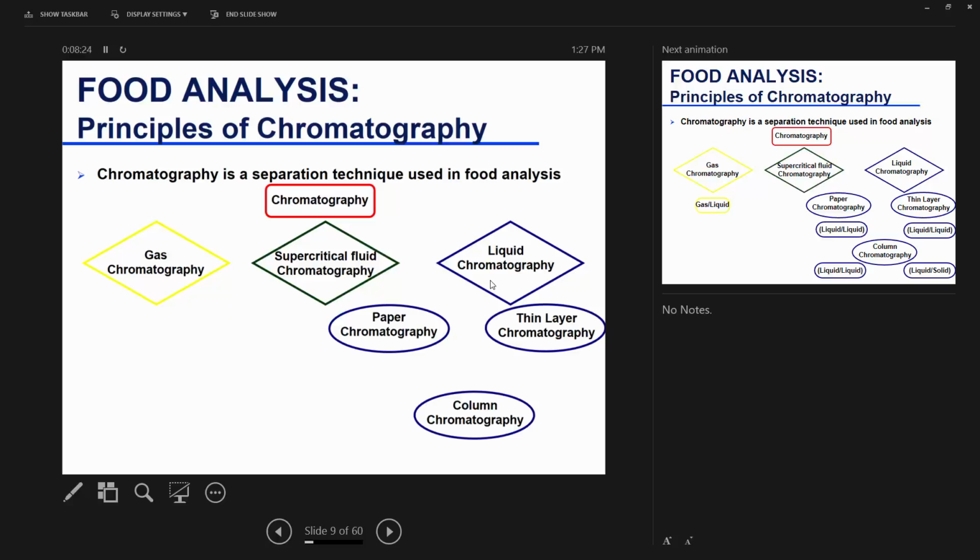So in liquid chromatography, there is something called planar chromatography. Planar, because it is a flat plane. So it can be vertical or horizontal. So planar chromatography is paper chromatography and thin layer chromatography. Paper chromatography is ancient. And how many of you have done paper chromatography in chemistry? You should all have done that at some point. Thin layer chromatography, some of you might have done that as well. I will talk about each one. They're very similar, but thin layer chromatography has better resolution.